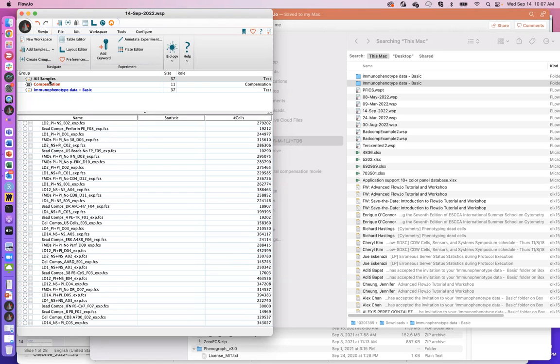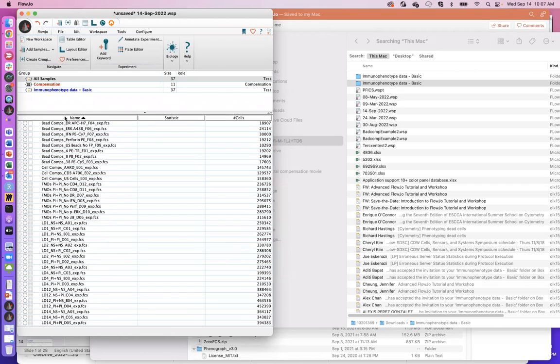So once we have the data files in hand, I like to sort the data, if necessary, just so that I can see things either in alphabetical order or perhaps based on some other information that's contained within the file. I can talk about that when we get to the metadata step in a second.